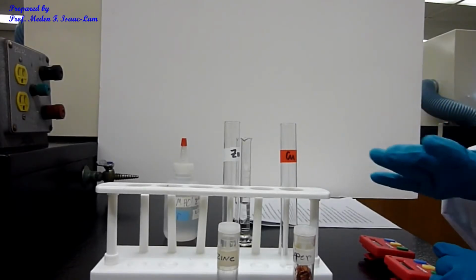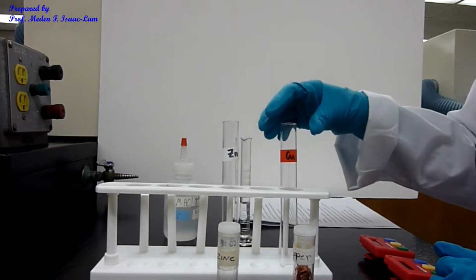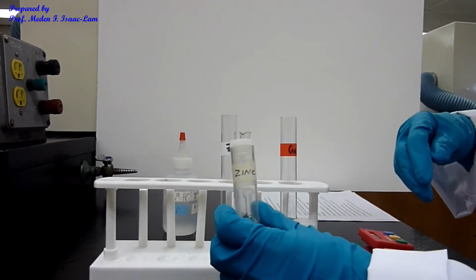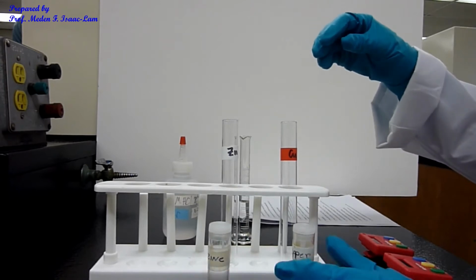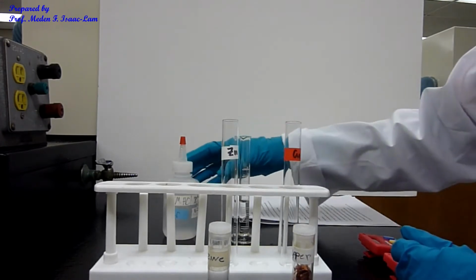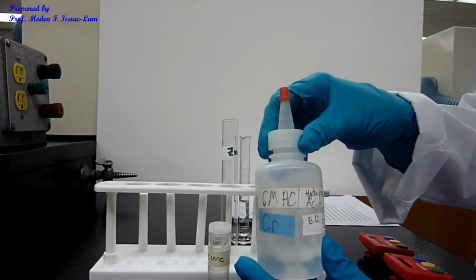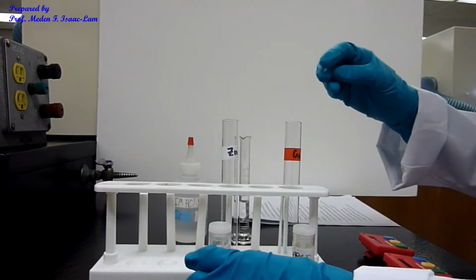I already have the experiment set up, so I have zinc, and then I will have copper. I'm going to put a strip of zinc in this tube, and then there's also the copper, and I will put one strip in the copper tube. I also have the 6 molar hydrochloric acid, and I will put 5 ml in each tube.